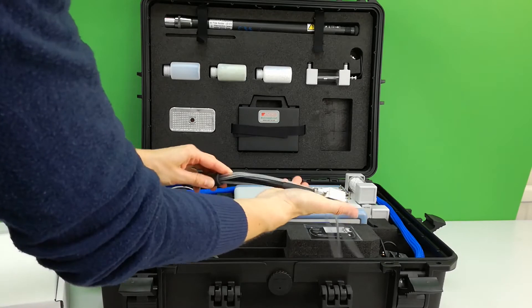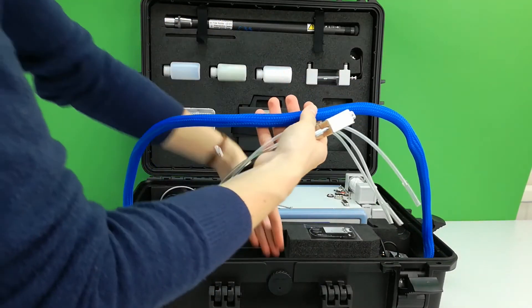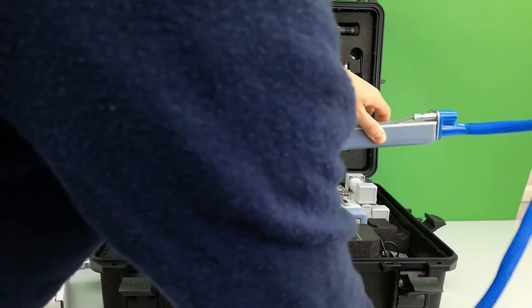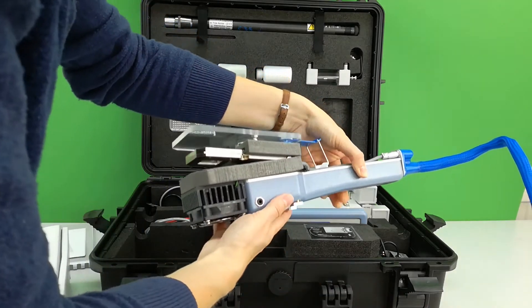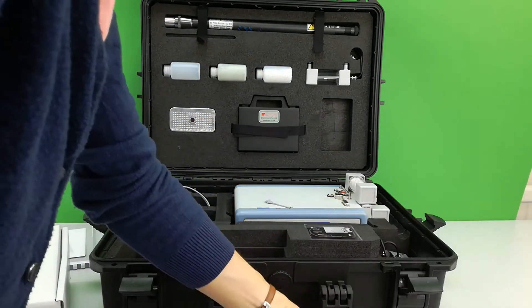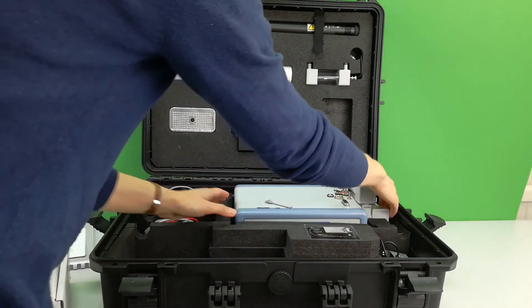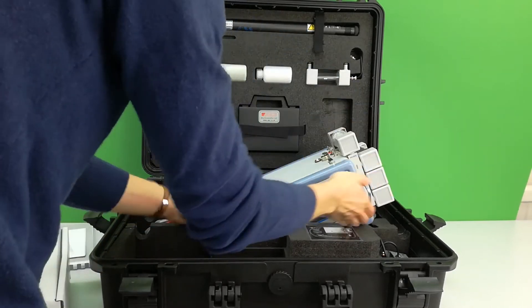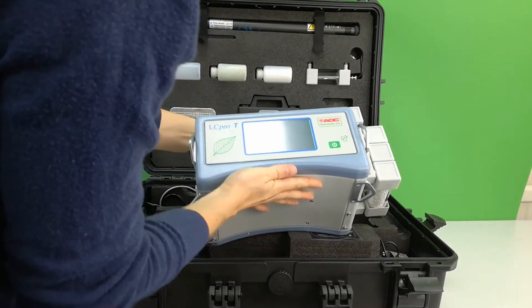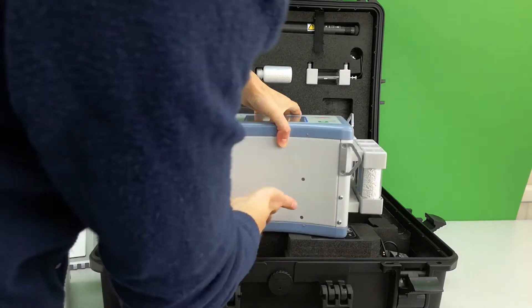The leaf chamber handle is positioned and stored like so to avoid damage in transit. Always store the leaf chamber open using the blue clasp. The main console is pulled out like so, and this is the LC-PRO-T with chemical columns on the side to allow full microclimate control within a leaf or soil chamber.